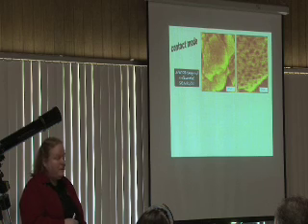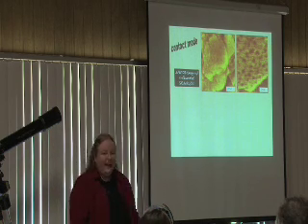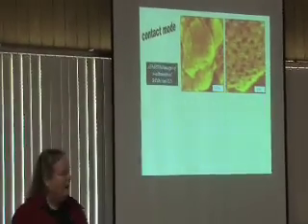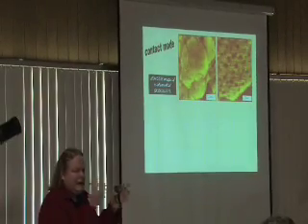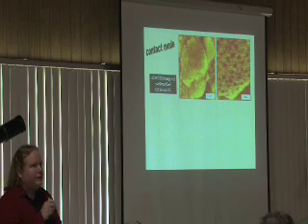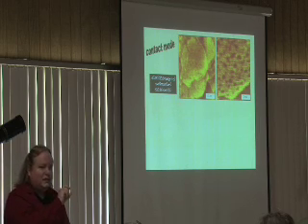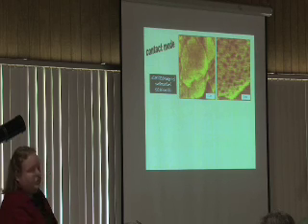These are AFM images from my lab where the surface doesn't look all that flat. It doesn't look periodic, like little individual bumps, when you look at it from a bigger view. As you zoom in, can we see those individual methyl groups? What you see when you zoom in are little dots. Those are actually dents in the gold underneath, and they're 2 angstroms deep. So what we're seeing are what are called etch pits, or molecular vacancy islands.